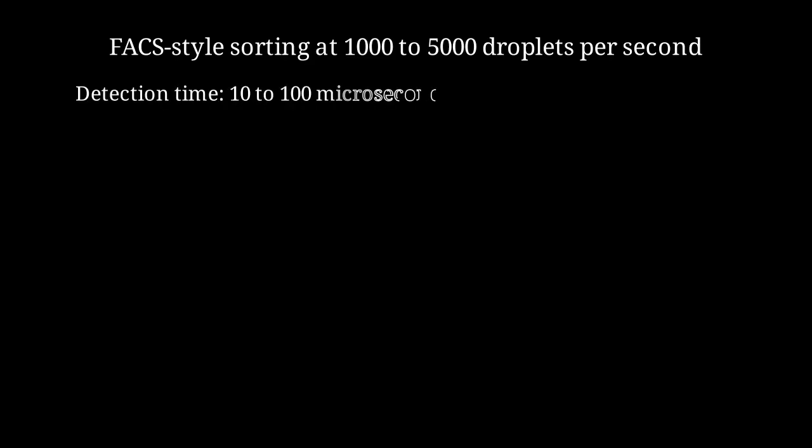The detection happens incredibly fast. Each droplet is interrogated in just 10 to 100 microseconds. This speed is what enables the massive throughput.